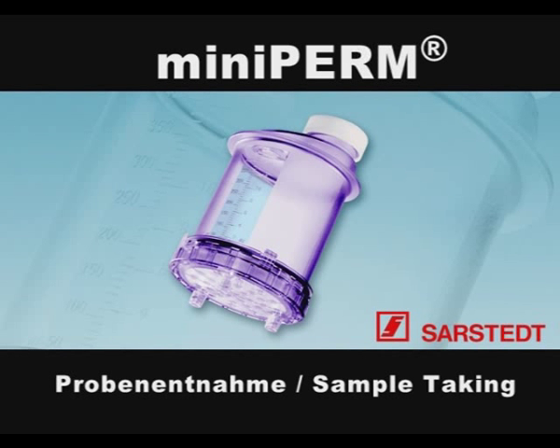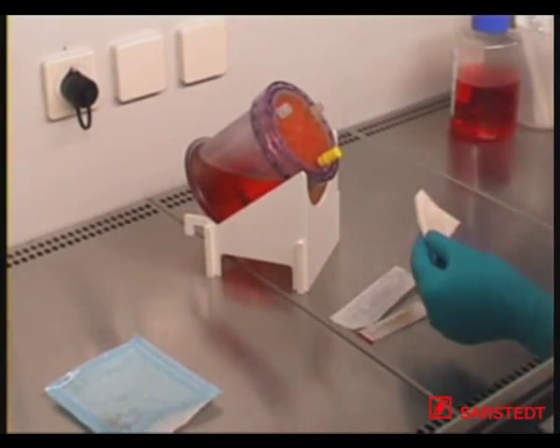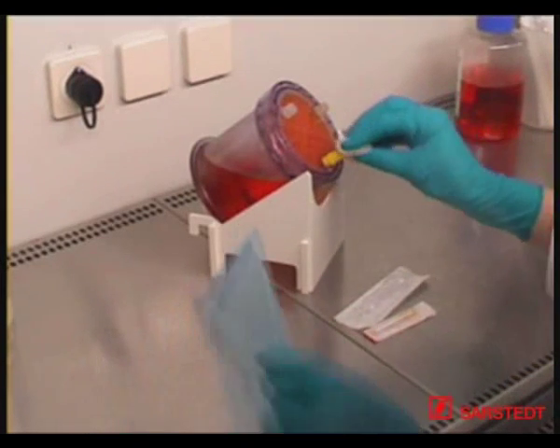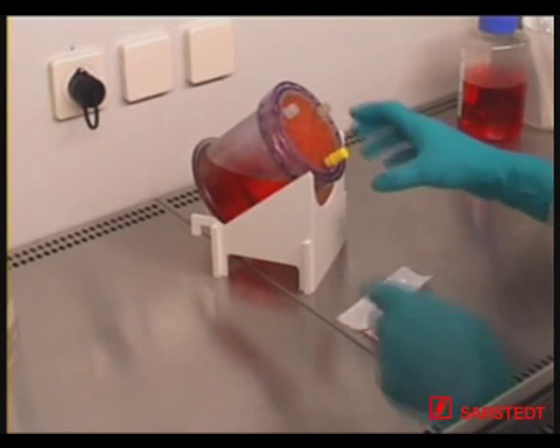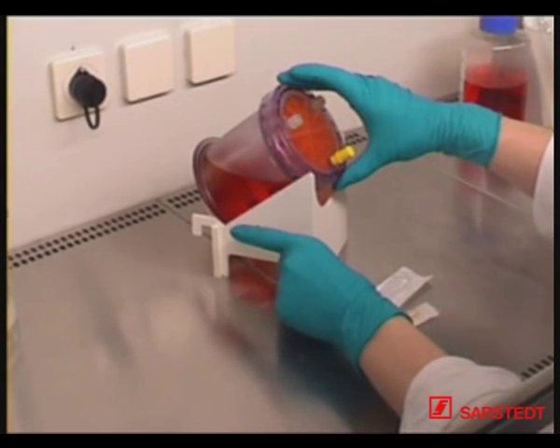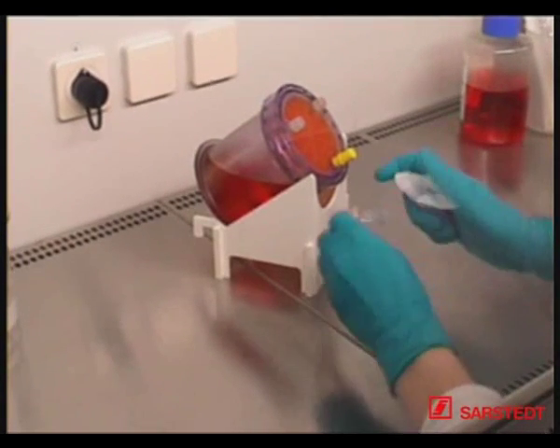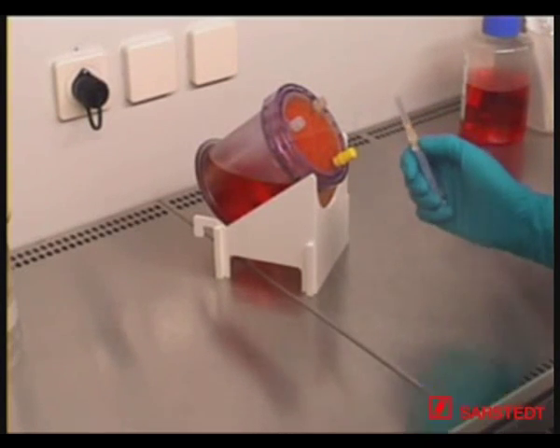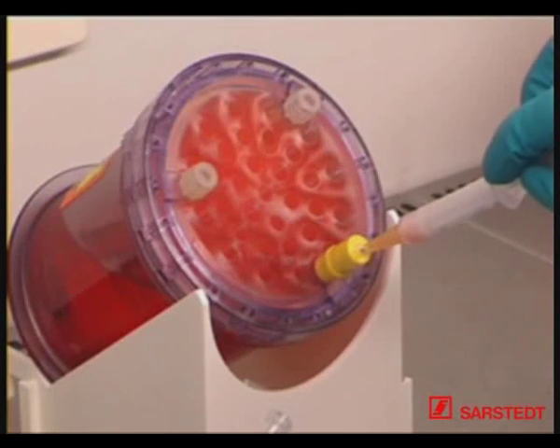MINI PERM sampling through a septum. Place the bioreactor onto the rack with the production module on top and clean the hole in the septum cap with a sterile pad soaked in alcohol. Ensure that the port with the septum cap is positioned below the liquid level. Pierce the septum cap with a sterile syringe and collect the required sample volume.